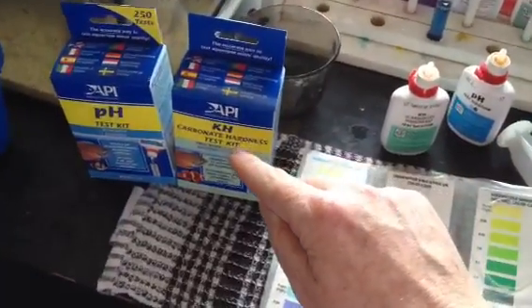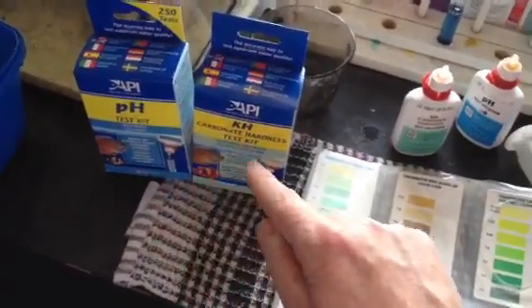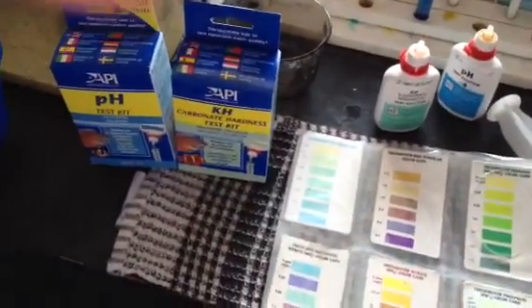The other thing is KH. KH is your buffering capacity — it helps to stabilize the pH. In a lot of tap waters there is high pH and low KH, but it's important to know what your tap water is. KH is the big killer, because not many people actually know much about KH.